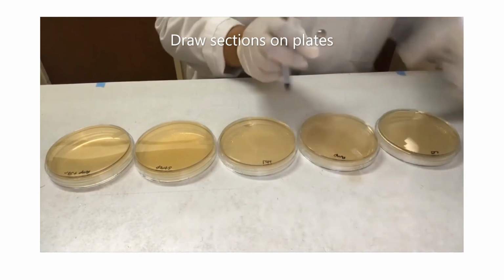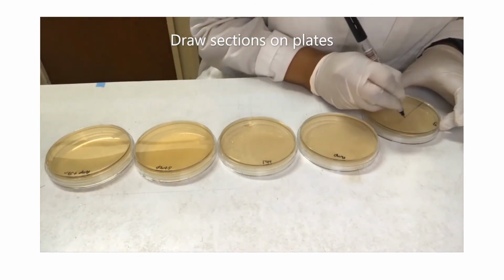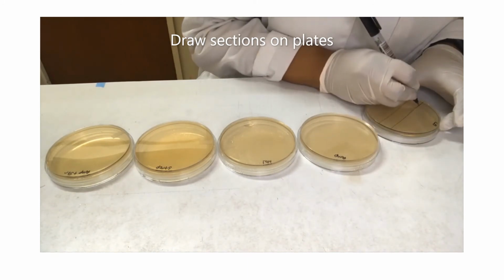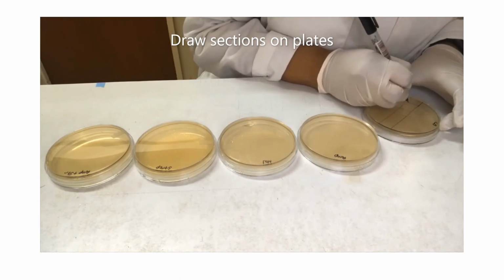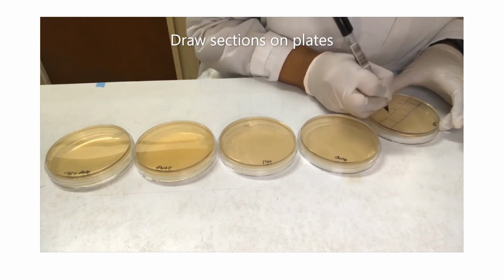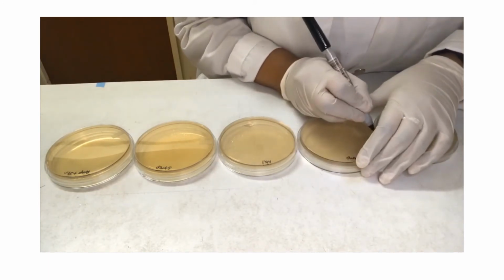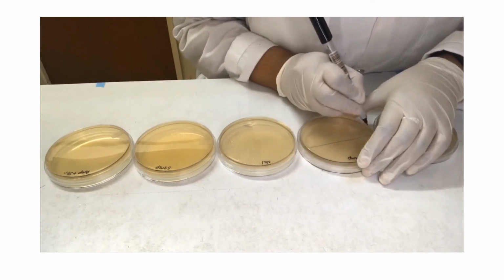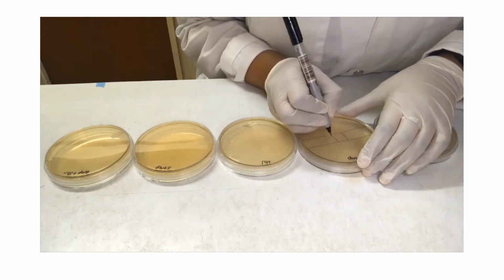The procedure for lab day 3 is demonstrated here. Please observe the antibiotic plates. Here, a 5th plate is included, which contains no antibiotic, it's plain nutrient agar. She then proceeds to divide each plate into 5 sections, as illustrated in Figure 3.